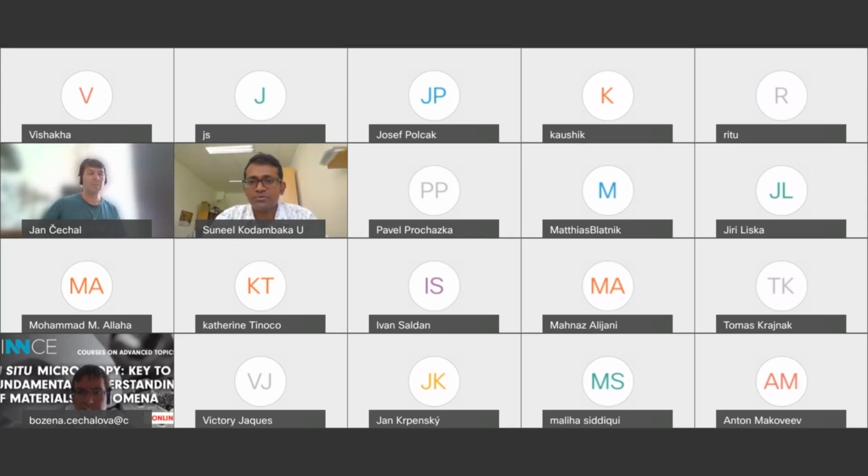Yes. So in normal vapor deposition, you will have a conformal coating. Assuming that you're using a vapor precursor, such as silane or disilane, you will get a conformal coating on your tip and everywhere, wherever you have a hot surface, if the tip material is all chemically homogeneous. If you have different chemistry at the tip versus the rest of the tip, then you may have different rates of deposition. But otherwise, you can get a uniform coating.